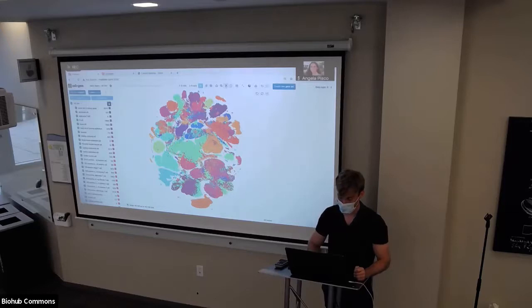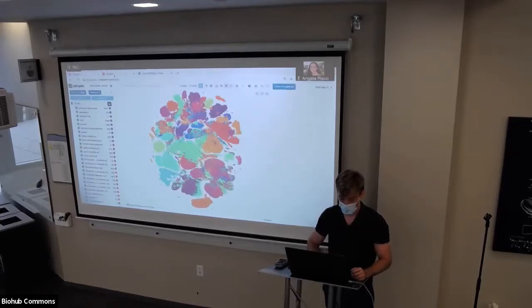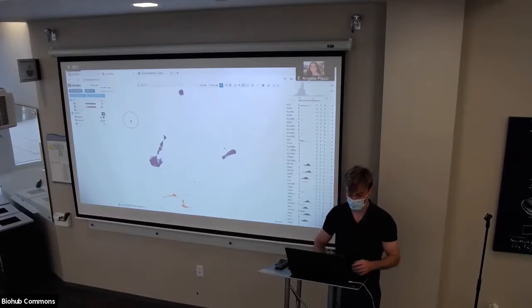You should be able to do the same thing for this demo data set, although here it's kind of nonsensical to use. But here we see there's PBMC3Ks there. Here there's PBMC 500 cells. Going back, well, actually now we'll switch back to this data set.